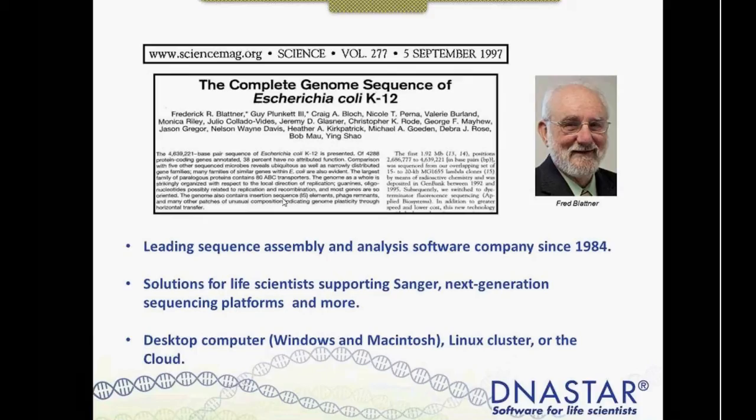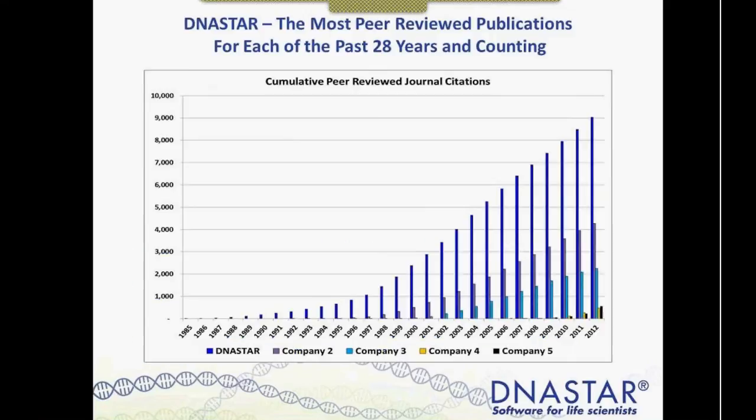And so this software then was really designed out of a necessity for genome sequencing. And when it was commercialized, we were able to have it run on desktop computers, now more recently up on the cloud, and hopefully to make these very powerful tools accessible to all of you. Our software is research grade. It is the most cited bioinformatics software in literature, and so you can see right now we're a little bit over 9,000 citations, which we hope that trend continues.